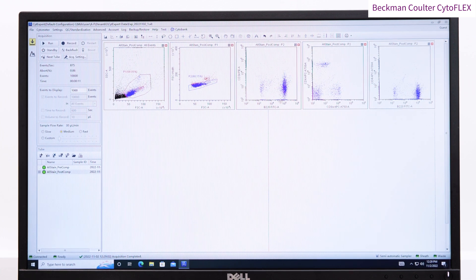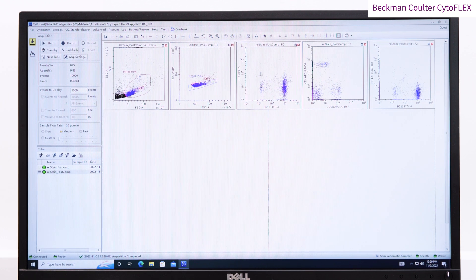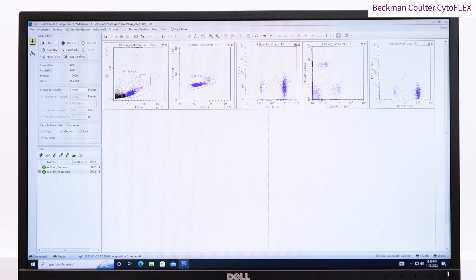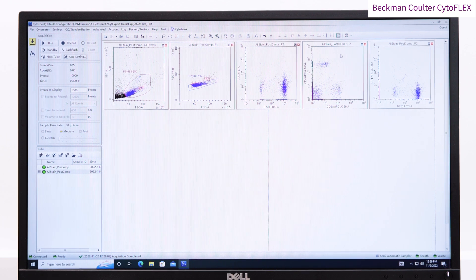We now have compensated data, and you can see the difference if I flip back to the sample we ran before compensation.